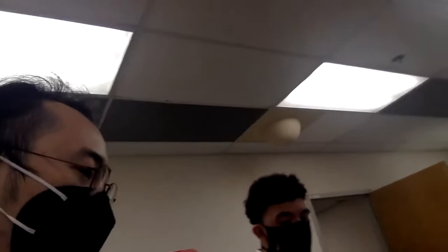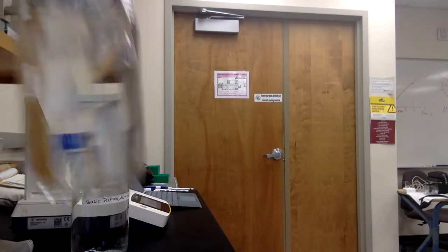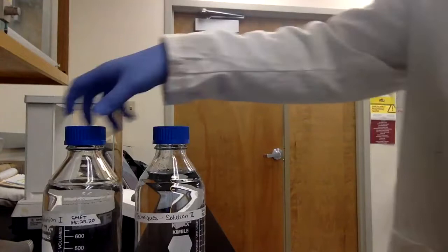So there are two solutions over there. You just grab your pipette tips over there, and some tubes that you are going to use. I think you need 8 of them because for each solution, you need to measure 4 volumes. These are the two solutions over here. They are transparent, clear, labeled solution 1 and solution 2.